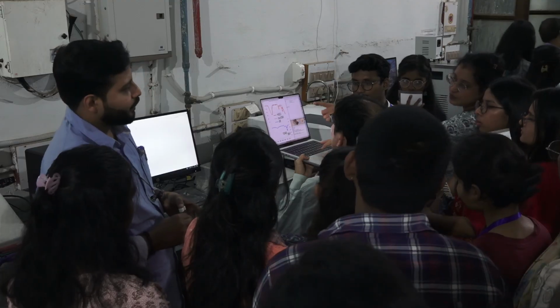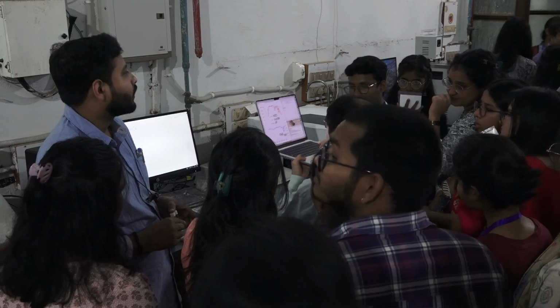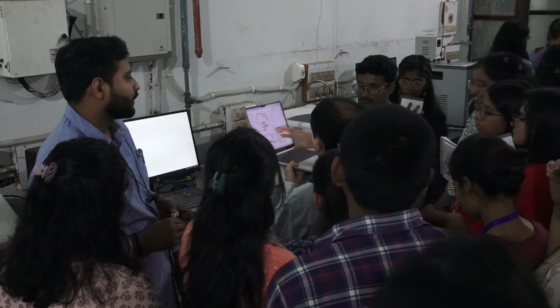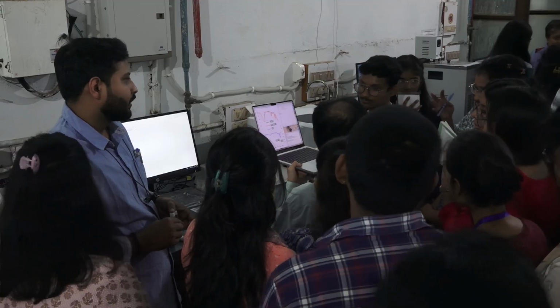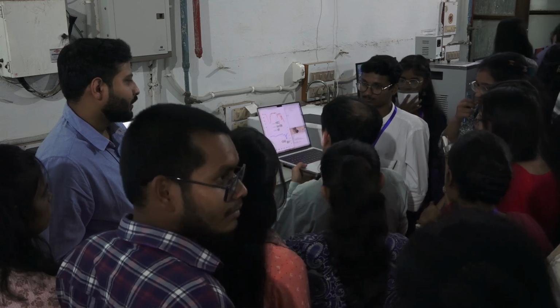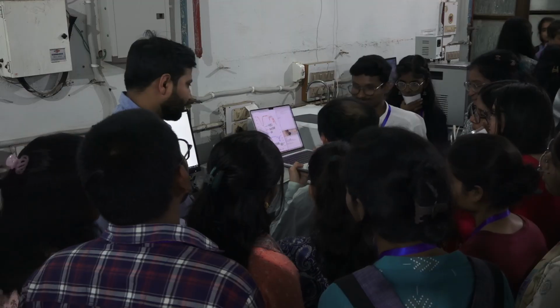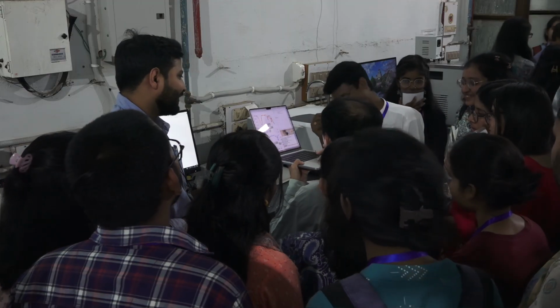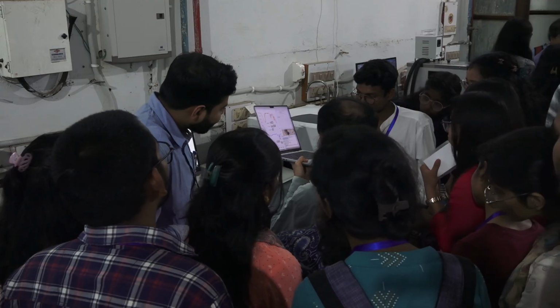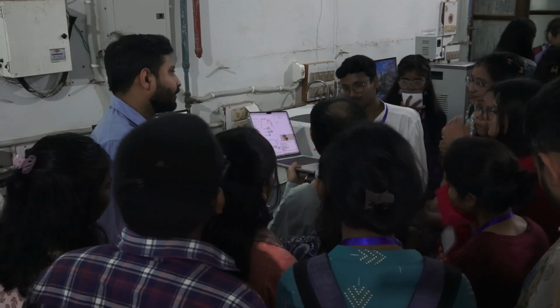All three spectra are now in a single graph. This depends on each application. I use display and append to graph. Then it appears in the same graph.